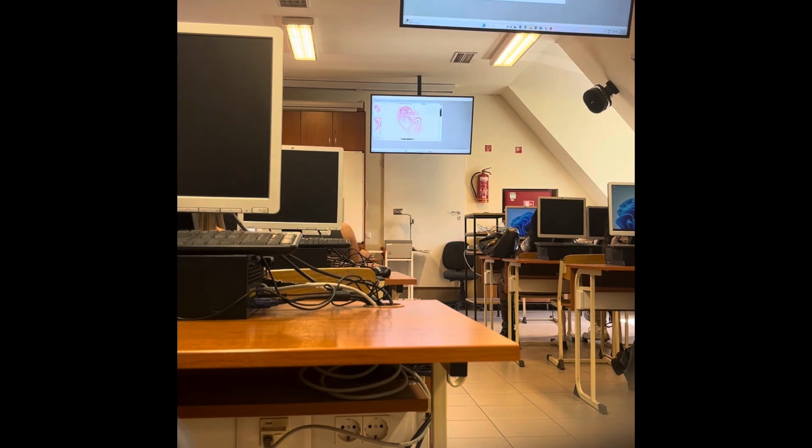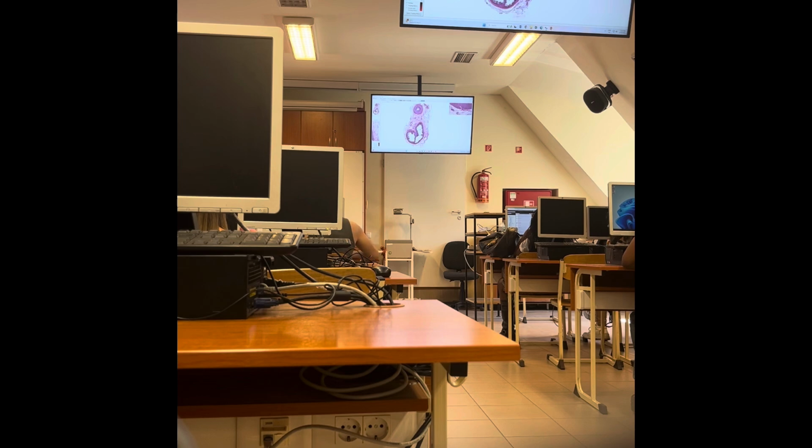One specimen, seminal vesicle, but I would like to start with this one. This is where the two organs are not very close to each other, but we can see them in one specimen. Both of these structures are surrounded by a common adventitial layer, so they are embedded into a loose connective tissue layer. And then you can see as the upper structure, the ampullary part of the ductus deferens, and this lower portion shows the seminal vesicle.